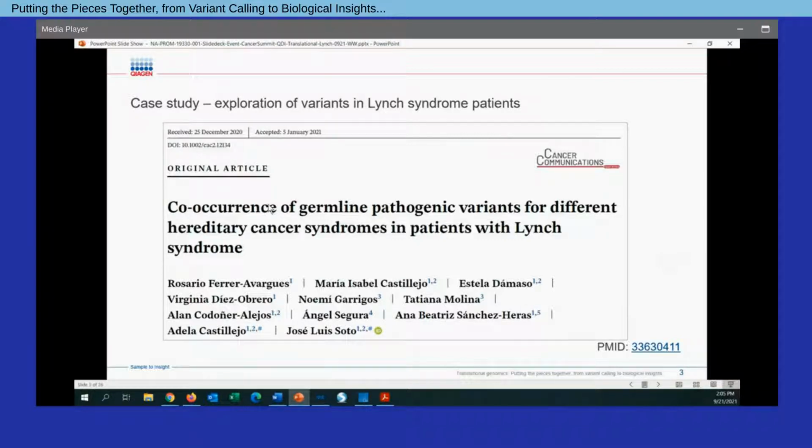So we're doing some germline NGS sequencing. In this study, the authors utilized a targeted panel, and their focus was on identifying and highlighting variants across a cohort of 84 samples, which may have variants of relevance for disease pathogenesis. In our context today, we wanted to choose this study because we're going to illustrate how not only can you utilize your own data, but you can also utilize public data to do some translational research as well.